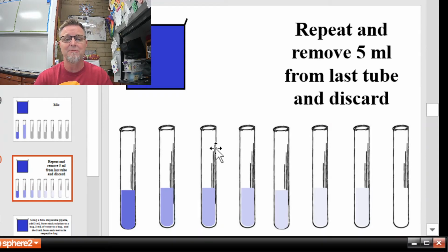That's the LD50. And if I'm an environmental scientist working in the field, I should be able to take a soil sample, measure the salt concentration, compare it to an LD50 experiment like this, and tell the farmer, tell the people, hey, everything's fine, or whoa, the salt concentration's getting really close to this LD50 level, and we're going to have some problems real soon. That's why we do it.